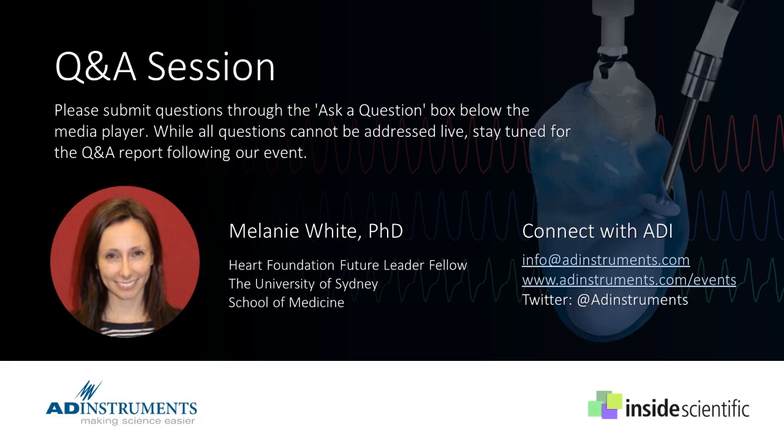And that's one thing I would say. If you are doing a long-term study, make sure it's always the same pair of hands doing the experiment. There's nothing worse than having to look at a series of hearts and try to understand what the difference is. And it just comes down to a different person conducting the experiments.